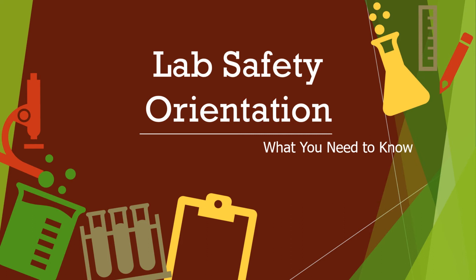A laboratory should be a safe place to work, not only for the teachers, but also for the students. When working in the laboratory, there is always a risk that an experiment may go wrong. Everyone in the laboratory must respect the need for safety. And for this presentation, I am going to give you a lab safety orientation. And what are the things that you need to know?